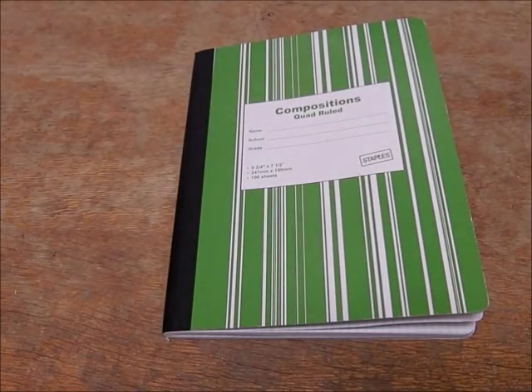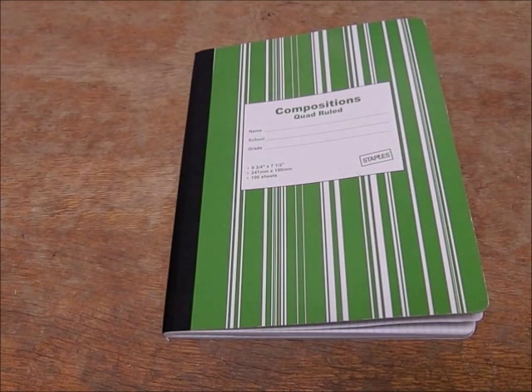This video shows how to set up a laboratory notebook properly for a chemistry class, at least for one at Maine West High School.